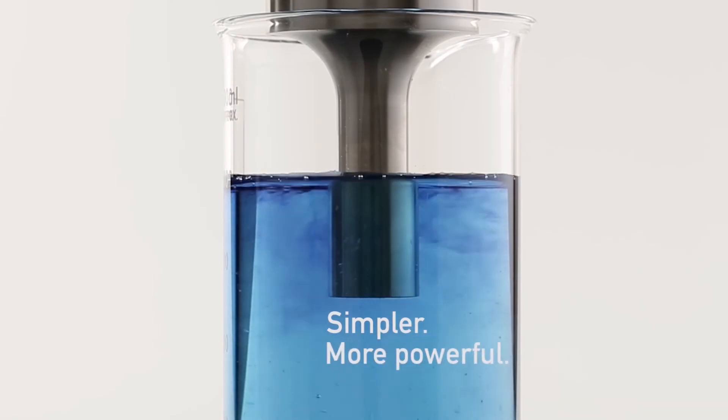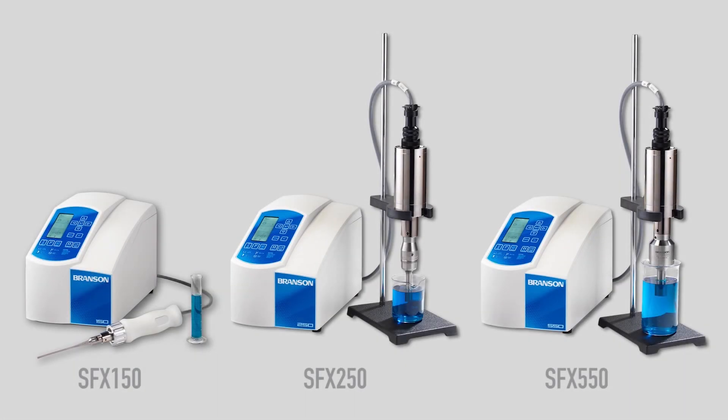Simpler, more powerful, more precise. That's the new SFX series. The most advanced sonifiers you can own. Only from Branson.